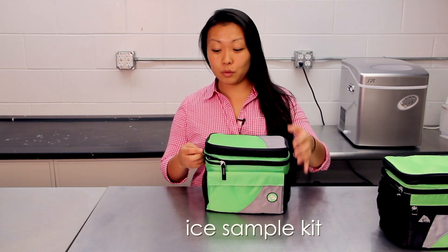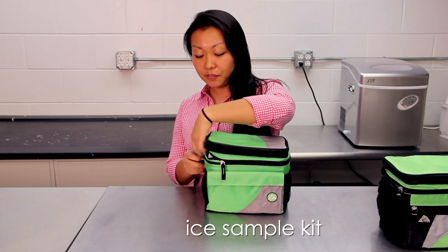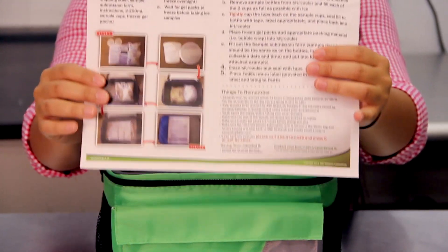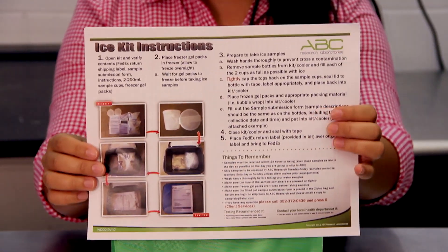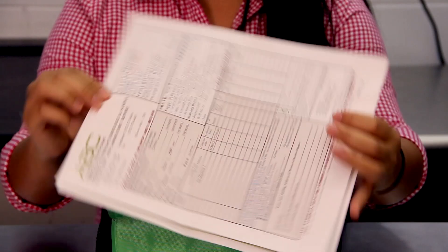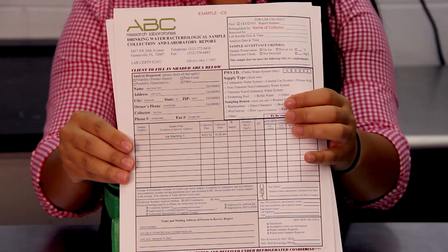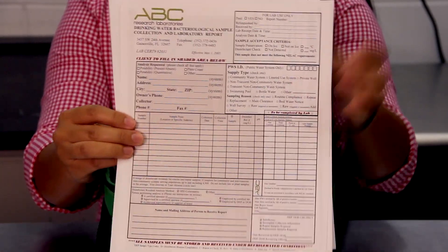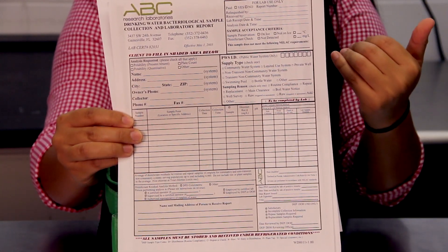The first things I want to go over with you are your sample kits. ABC Research Laboratories will supply you with these. This first kit is your ice kit. The first thing you will receive is picture instructions on how to sample your ice. You will also receive an example sample submission form and a blank sample submission form where you will describe your samples.